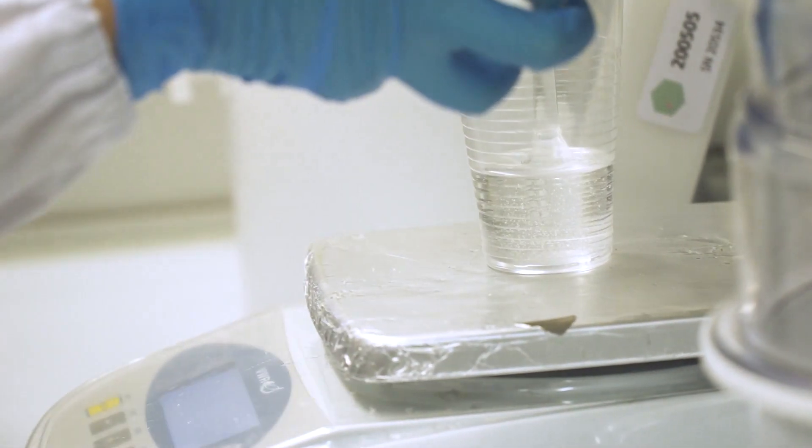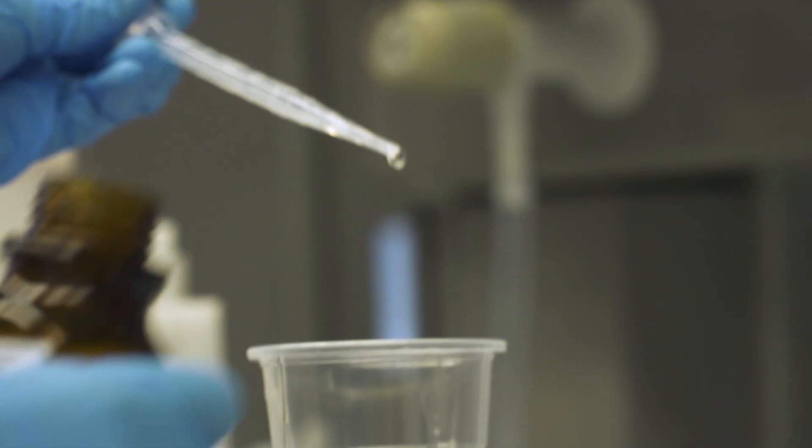To create this breast on chip platform we are using microfluidic devices previously developed by our group leader Christina Hasse. These microfluidic devices are made of PDMS.